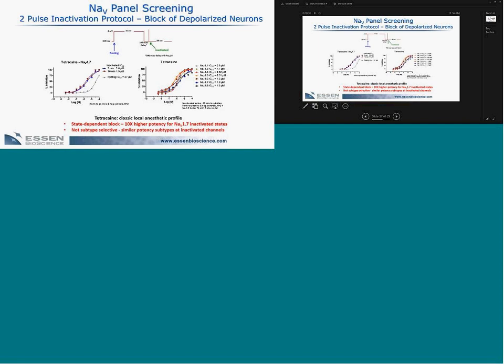at minus potentials. I think it was minus 90. Addition of a tear gas derivative, which is another known TRPA1 activator, you get a large inward current. That can be blocked by a TRPA1 blocker and then completely blocked by another reference compound from the literature, A967079, and then this can be washed out. So this shows that you can do these kinds of experiments in electrophysiology, and there's a lot of flexibility in how you do it, and the quantitation is quite good.